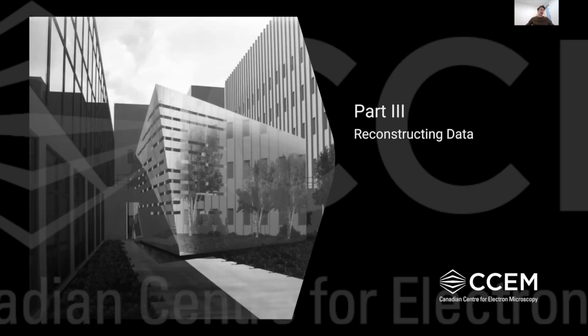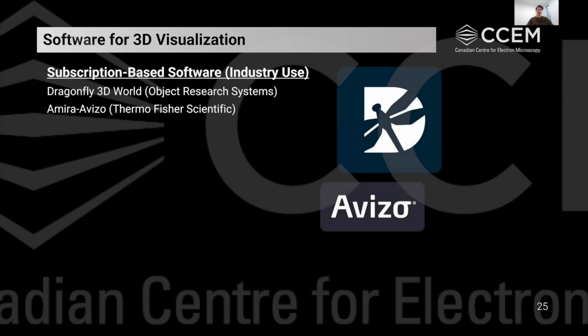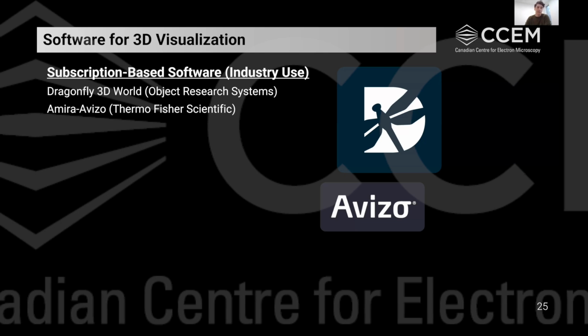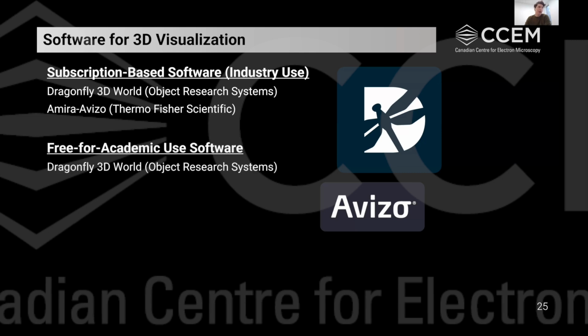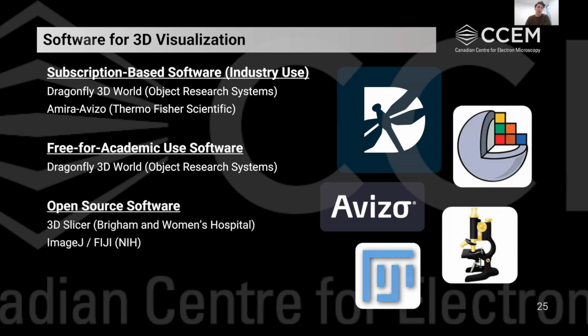Okay, so we've set up our run, we've set up our automated acquisition, we've got our data, now what? In the data reconstruction, there's a number of software packages that you could use to actually render your data and take measurements. There's subscription-based software available for industry use, things like Dragonfly 3D World, for instance, or Amira Avizo offered by Thermo Fisher. If you're an academic user, Dragonfly 3D World is free for academic use through Object Research Systems, or you can use any number of open source software. Things like 3D Slicer and Fiji have plugins to be able to handle these 3D data sets.